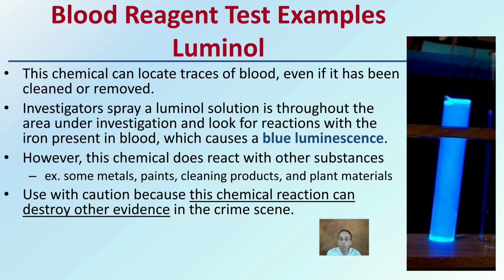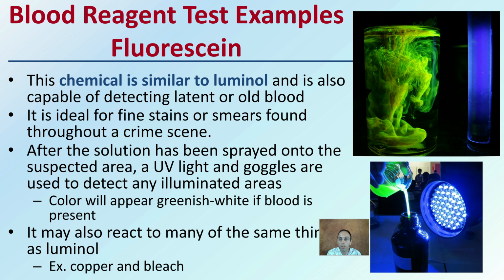So use this with caution because this chemical reaction can destroy the evidence on the crime scene. If you're overusing this, you can potentially harm the original evidence, which can impact the investigation later on.